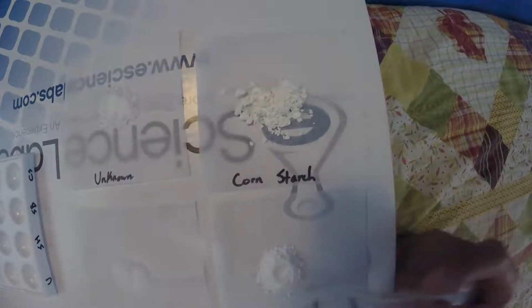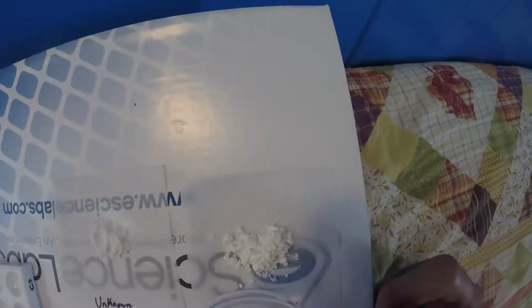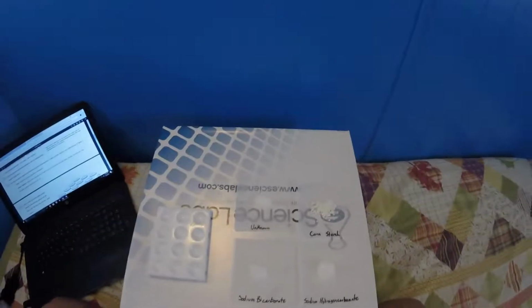The sodium hydrogen carbonate, it's a little clumpy, but it is somewhat smooth when you move around. The cornstarch is clumpy, kind of looks like cottage cheese, or little rocks. It's also white in color, and the unknown substance, also white in color, a little clumpy, has very close similarities to the sodium hydrogen carbonate. So we'll move on.